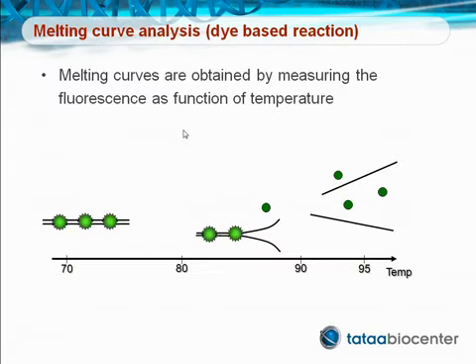Different PCR products formed in dye-based qPCR can be distinguished by post-PCR melt curve analysis. After completed PCR, the sample is gradually heated while fluorescence is recorded. As the temperature rises, the double-stranded amplicon melts, the dye dissociates, and the fluorescence drops.